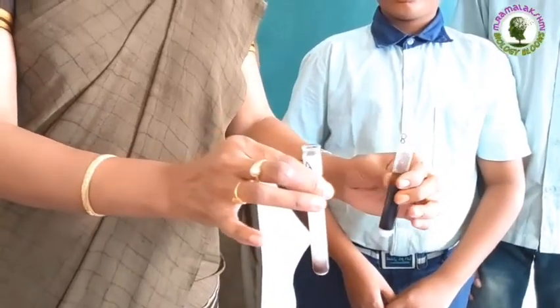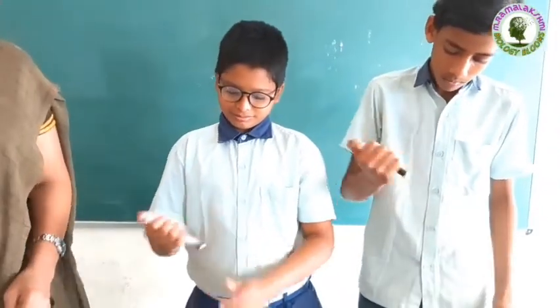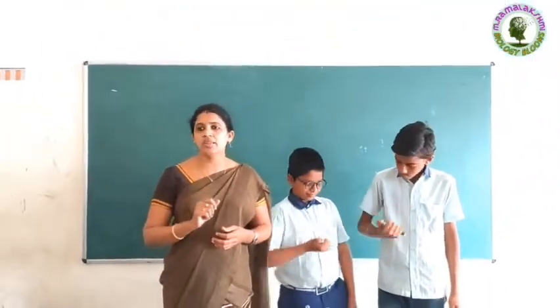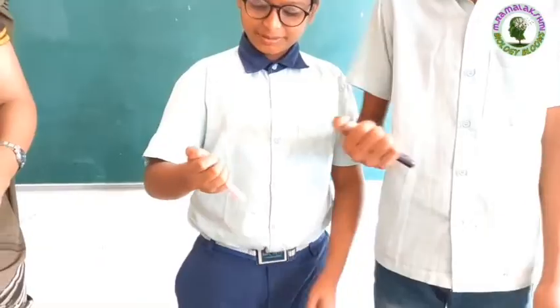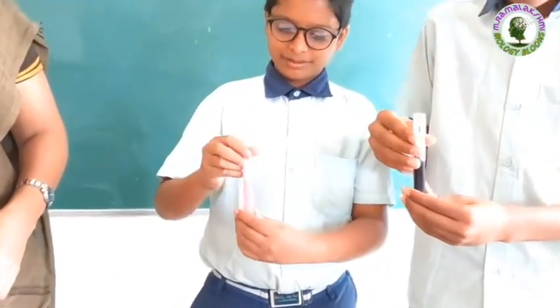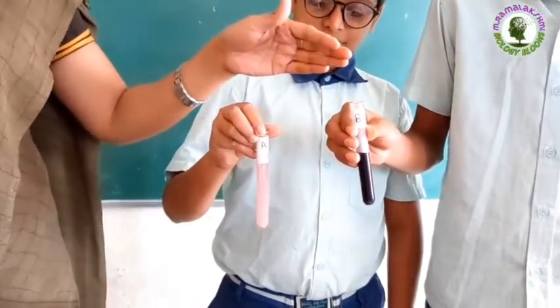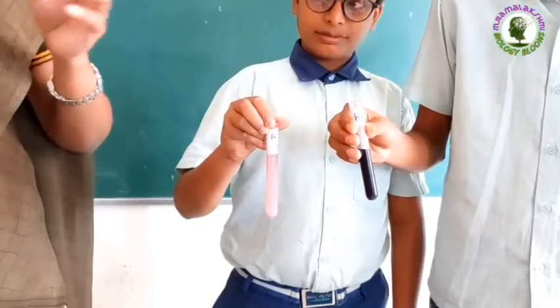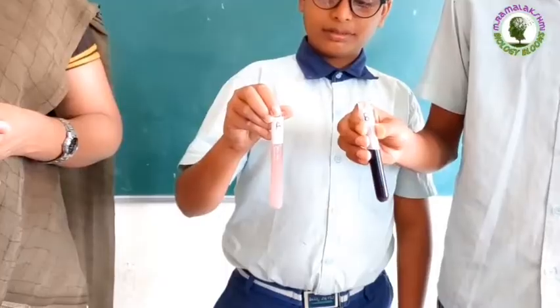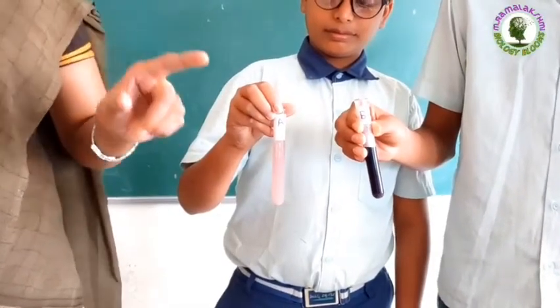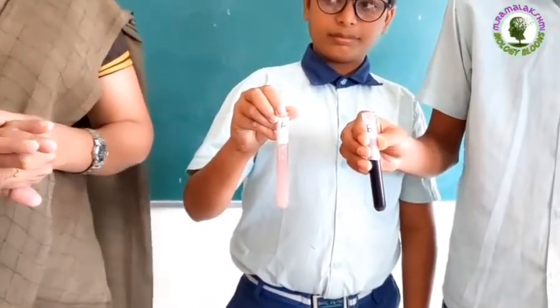Observe the color changes. Shake it. In which test tube did you add the saliva — A or B? A. So we will observe that. Children, observe both test tubes. Which starch solution has turned blue-black? B. What about A — has it turned or not? No. But we took the starch solution in both test tubes. Yes, but here it has not changed. Why? Do you have the reason?